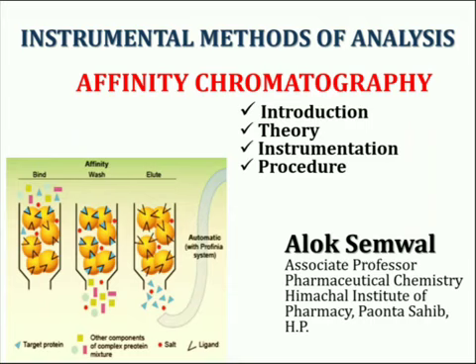Hello students, my name is Alok Semwal and today's topic of discussion is affinity chromatography. In this I will discuss introduction, theory, instrumentation and procedure of affinity chromatography.